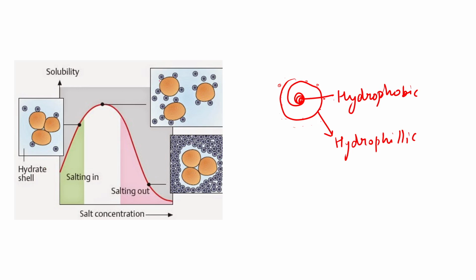Now as we are adding more and more salt, the salt is competing with the water molecules. So what will happen? The salt will start exposing the hydrophobic core of the protein. How is it exposing the hydrophobic core? Because it is replacing the water shell that was present. Around this protein, this blue box that you can see is the water. These water molecules are protecting the hydrophobic core from getting out into the aqueous medium.